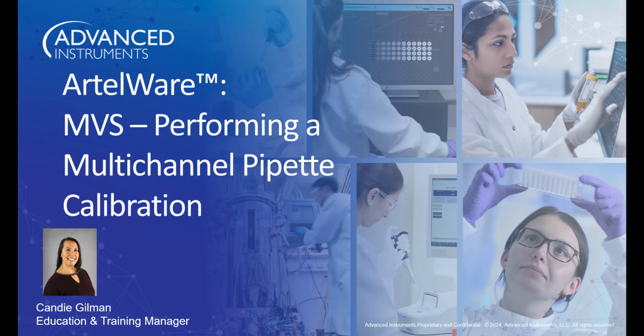Thank you for joining me for this brief video that walks you through performing a multi-channel pipette calibration using the MVS system with the ArtelWare software application. I've got a lot of information to share with you, so let's go ahead and get started.